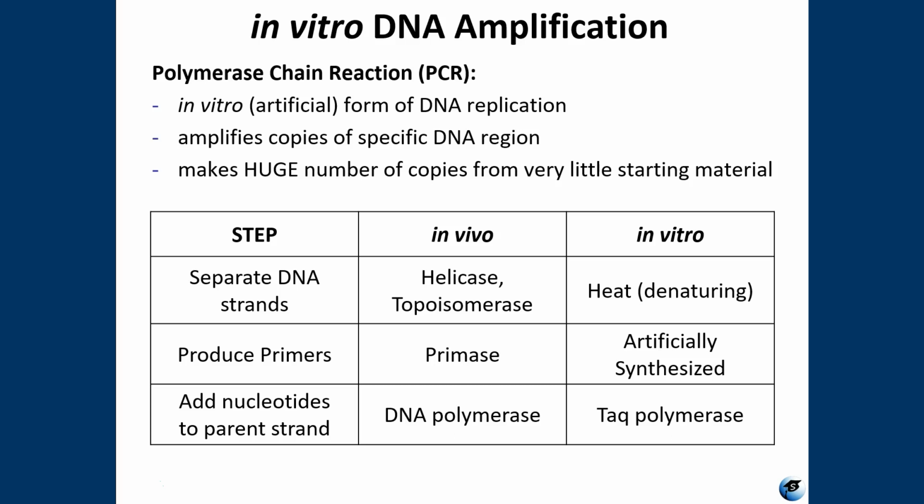So your DNA primers with known sequences targeting a specific known region of DNA are actually synthesized. It's done commercially, so you can actually send this off, tell them what you need, and they send it to you. It's amazing. These DNA primers bind to specific targets due to their complementary base pairs, and then the target sequence is amplified.